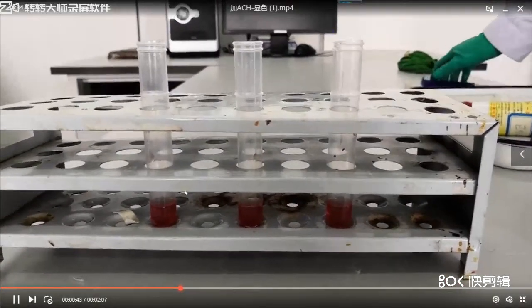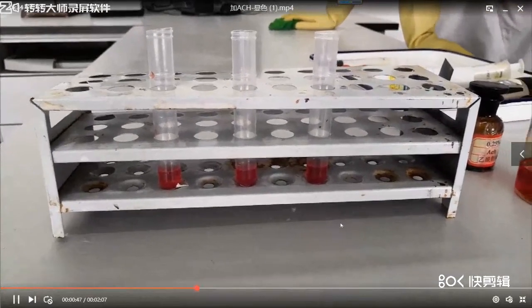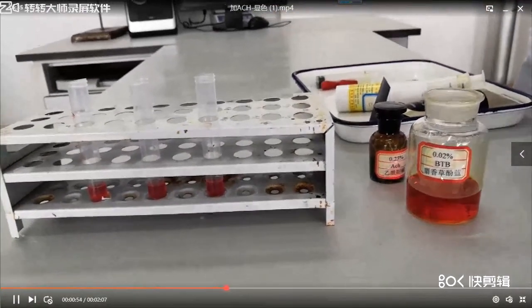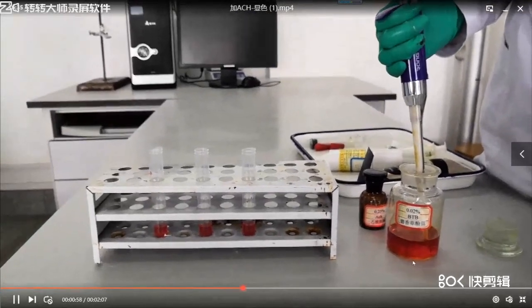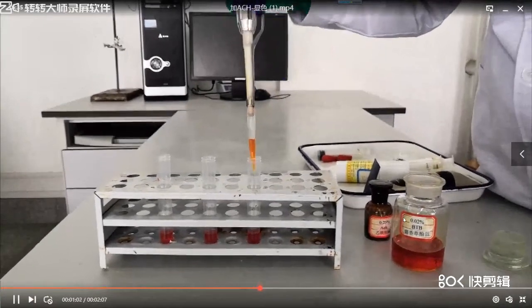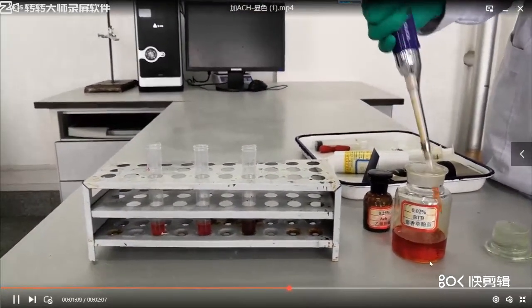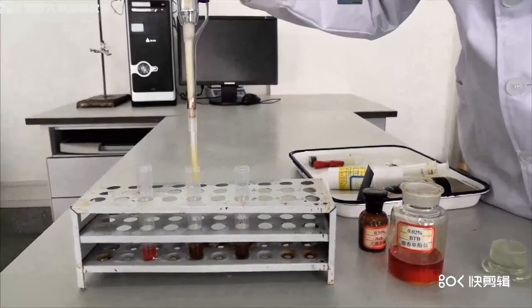And we can put these 3 tubes into the water and wait 10 minutes. And then, at last, we give this BTB, colorimetric solution, 1.5 milliliter in each tube. And we'll have different colors.